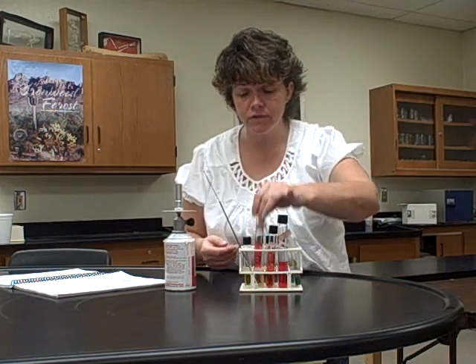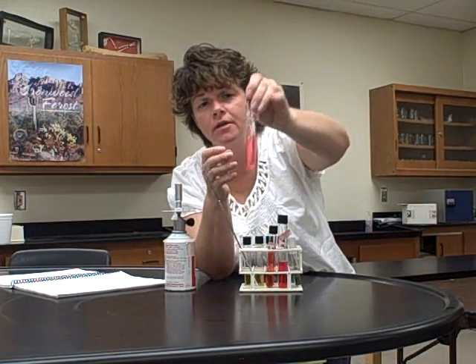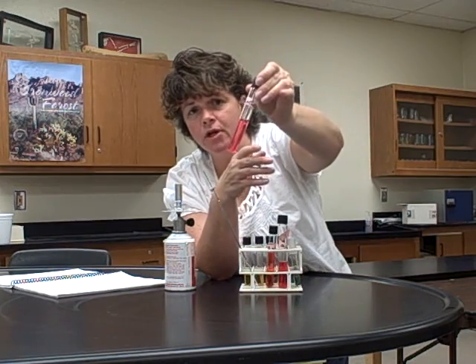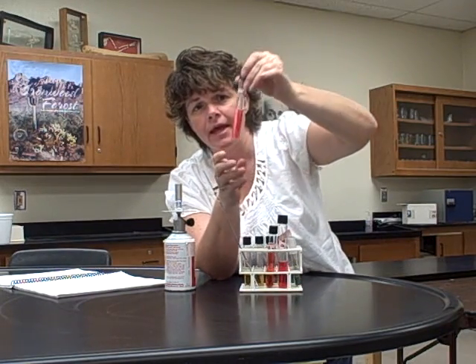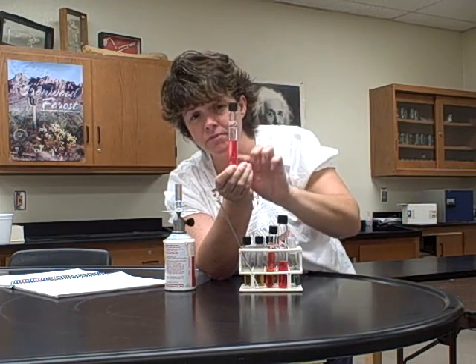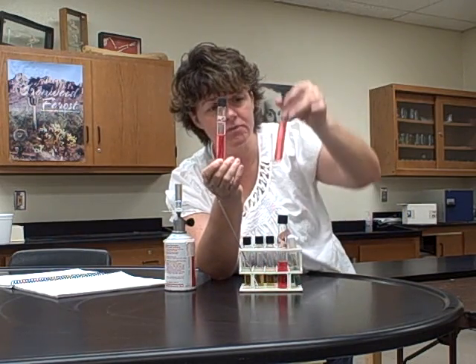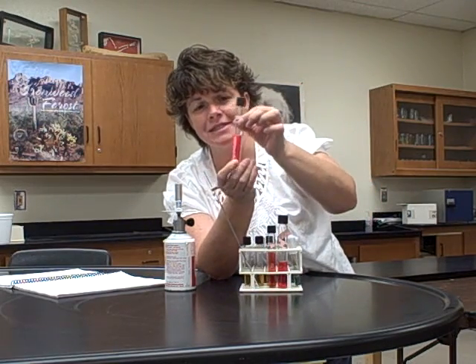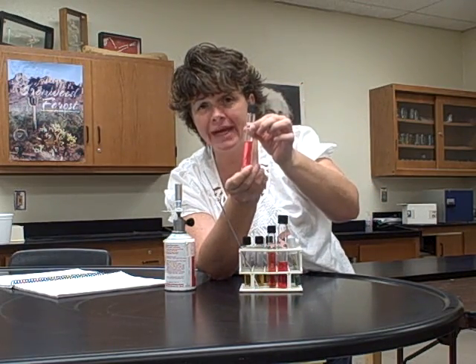Okay? So if you'll notice, I don't know if you can or not, I hear it clicking, but inside this tube, there's a really small tube that's upside down. And that small tube that's upside down is called a Durham tube. And this one is completely full. This one here has an air bubble in the top of it. So when detecting the presence of gas, you're looking for an air bubble.